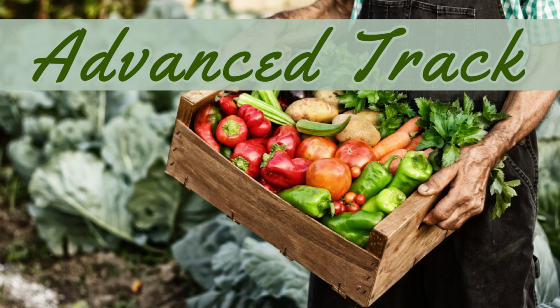Cover slide. You put it at an angle on the edge of the dot, and then you let go. Putting it on an angle at the edge of the dot pulls the water to it, goes across the whole slide cover, you lay it down, it spreads it out. At that point, you take a look. We are fortunate enough to be able to look together. Okay?